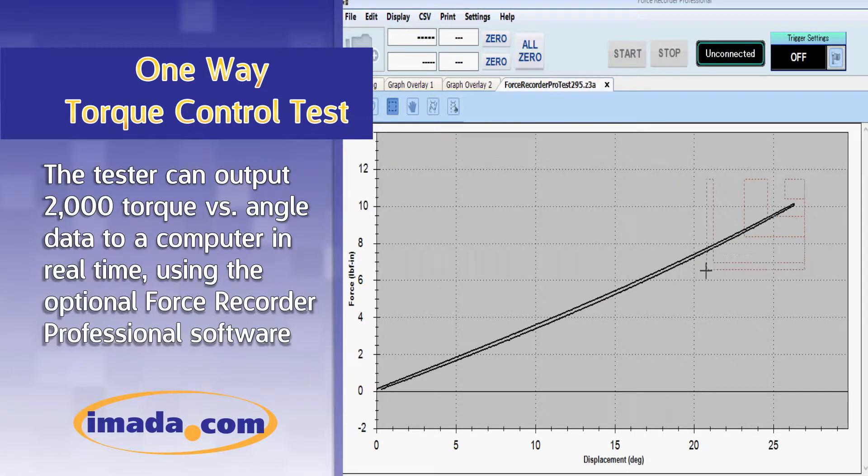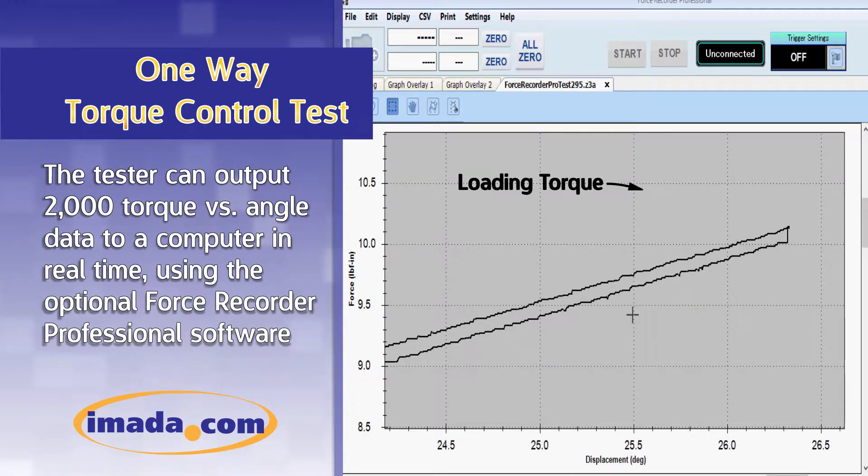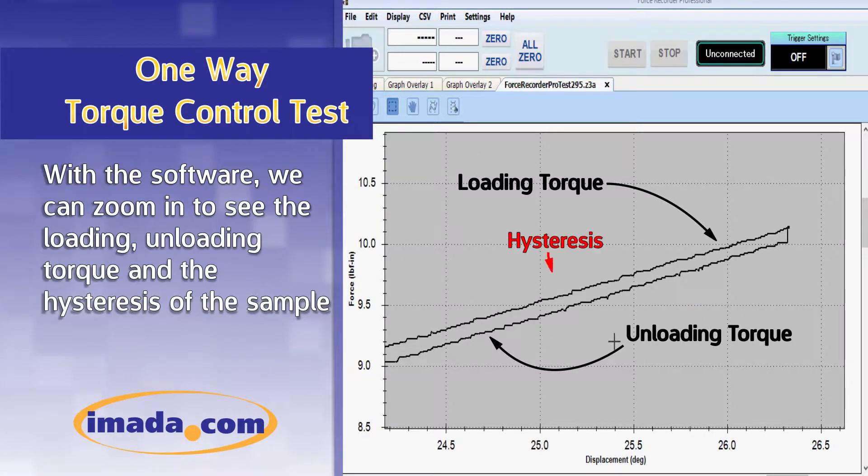The tester can output 2000 torque versus angle data points to a computer in real time. With the software, we can zoom in to see the loading and unloading torque and the hysteresis of the sample.